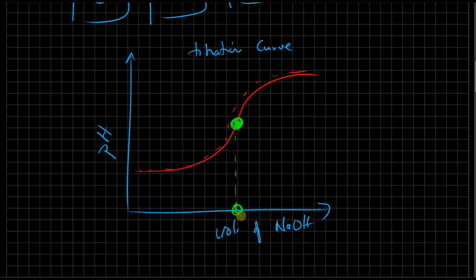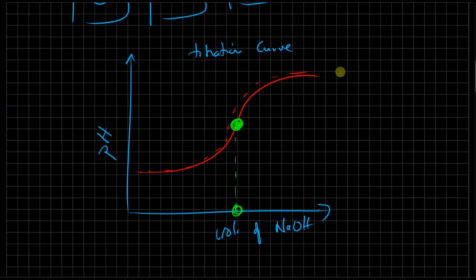So we're not going to use an indicator, we're going to use a titration curve, and the benefit of this is in case you shoot past the equivalence point, you can go back and look at your graph exactly to find that endpoint. Okay, so you're going to do 4 titration curves each week. The first one is always going to be a rough trial, and then 3 very smooth titrations.